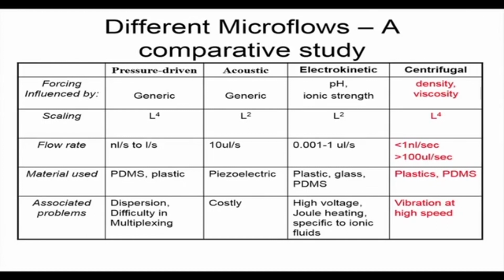The materials used for pressure driven flow, common materials are PDMS, polydimethyl siloxane, that is PDMS, and plastic. For acoustic actuation, the material used is commonly piezoelectric material.